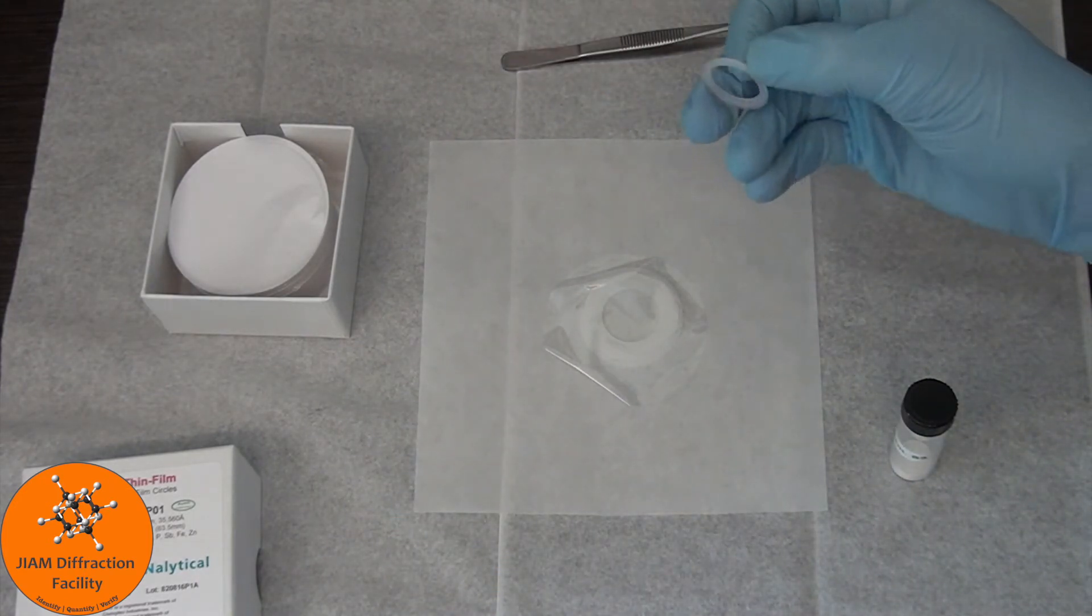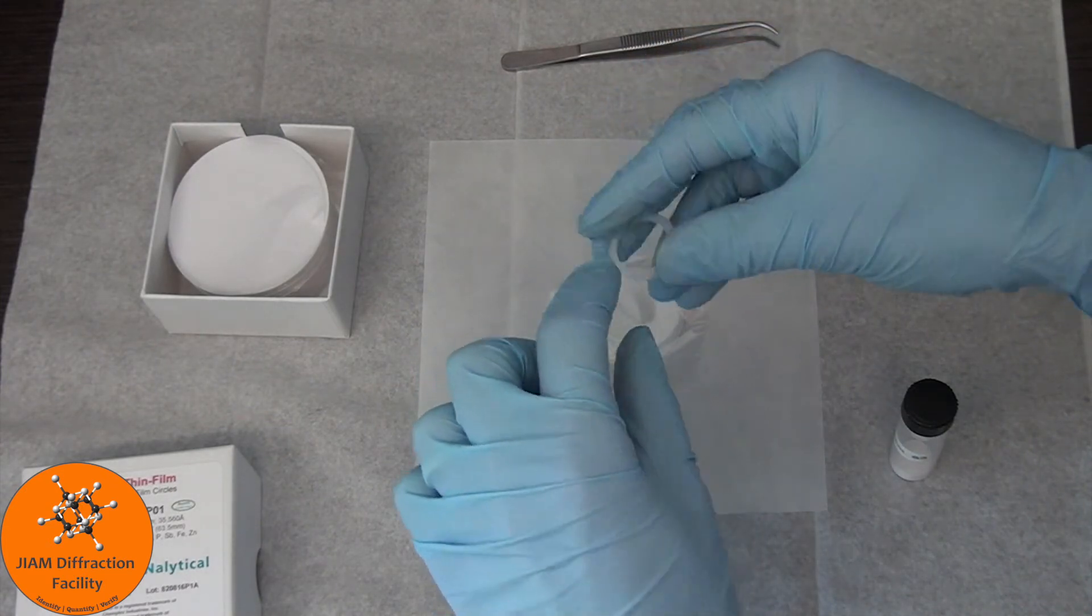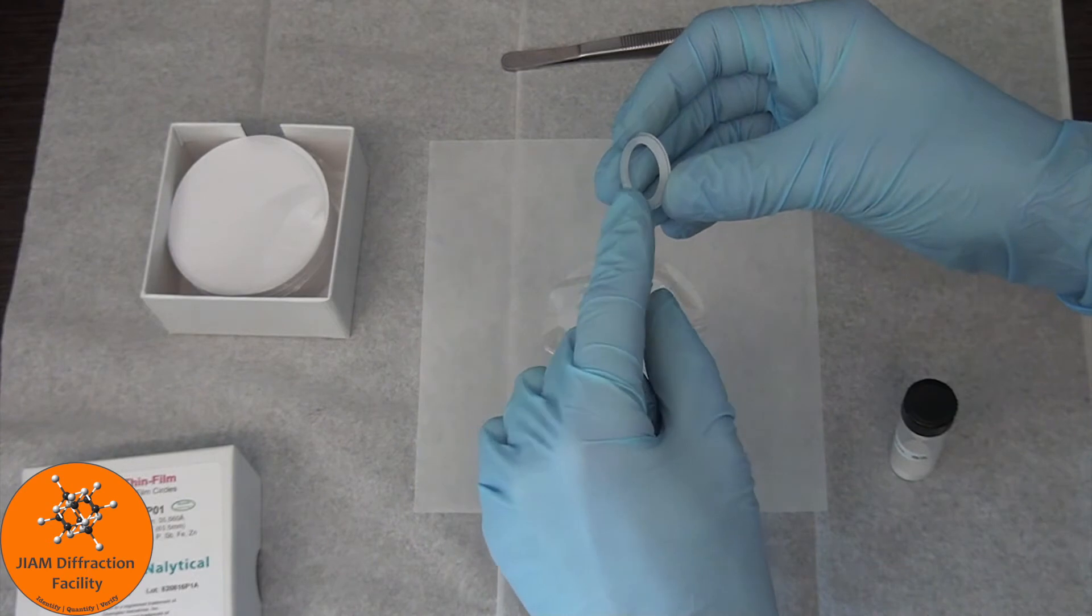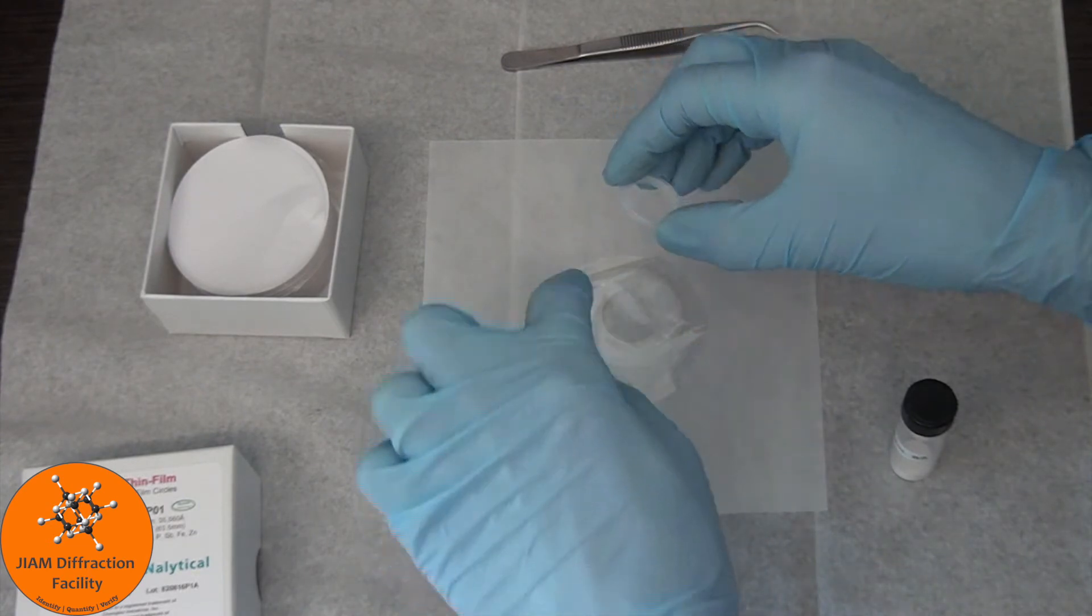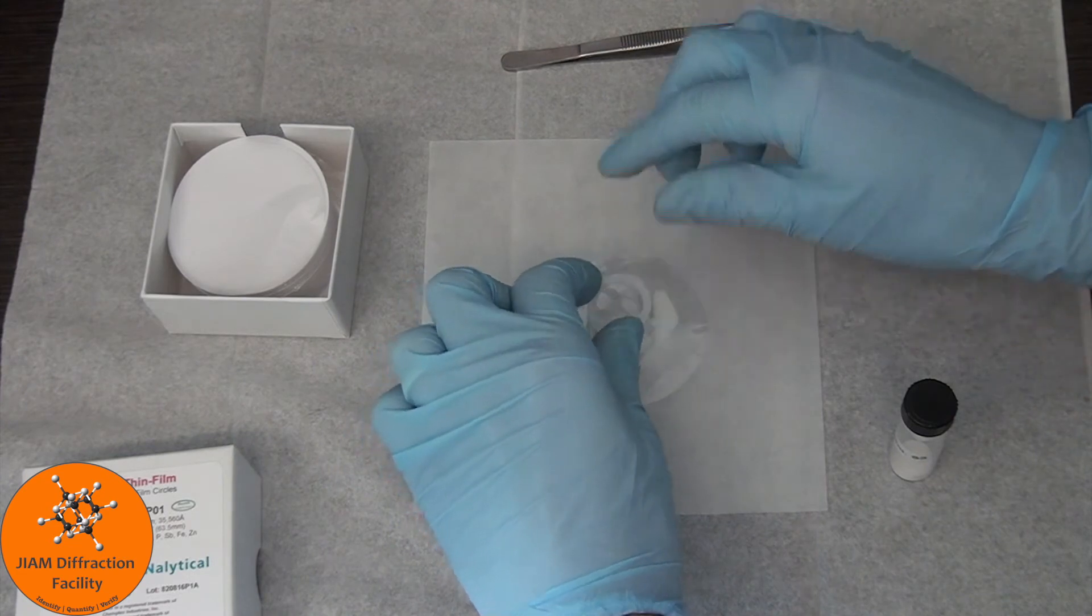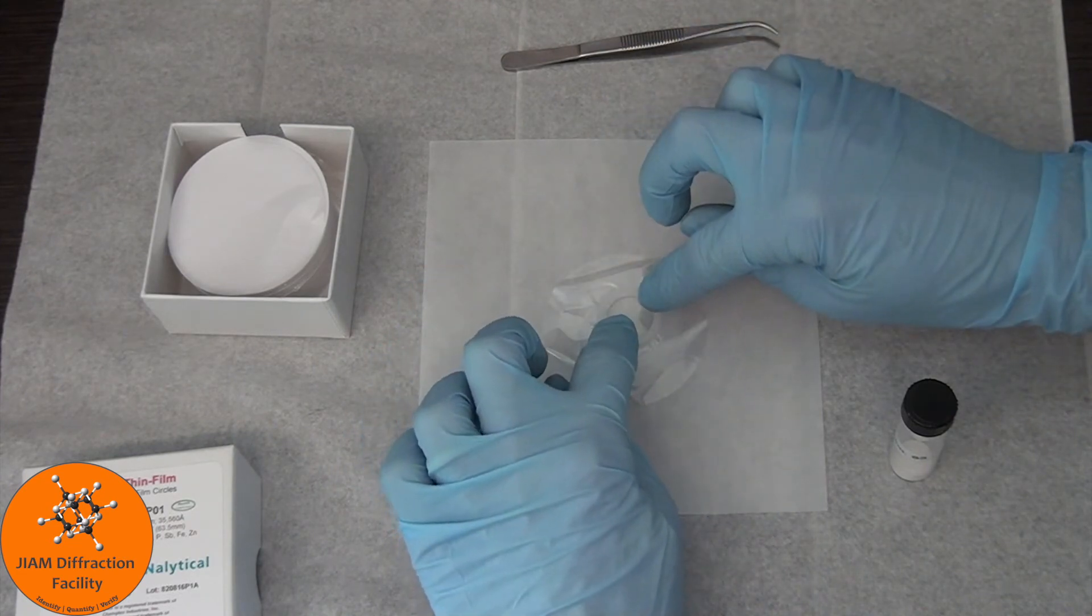We then have this smaller piece that also has a flat side and a raised side. But this time, we want to have the raised side face down, and we will put it in the center of the larger piece, and then just press down.